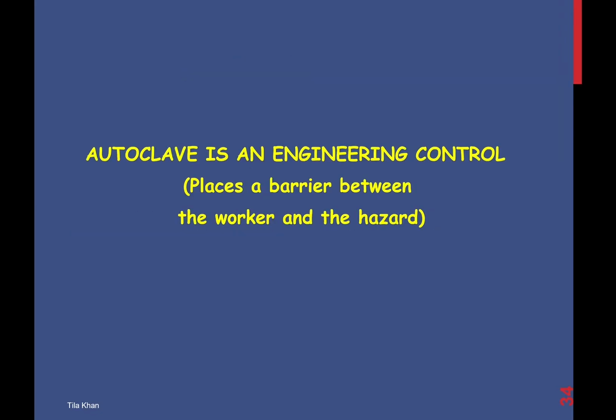Please remember that autoclave is an engineering control, which is a permanent structure designed to place a barrier between the worker and the hazard. Please don't confuse it with a work practice control. Rather, it is an engineering control.